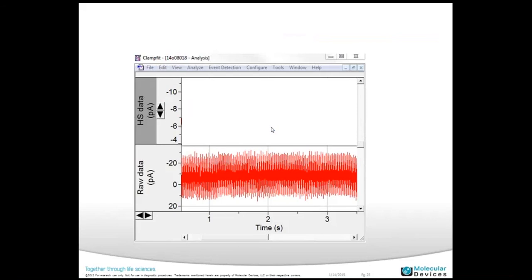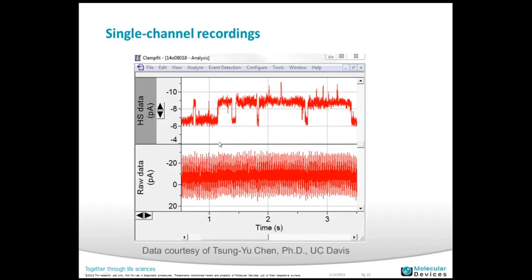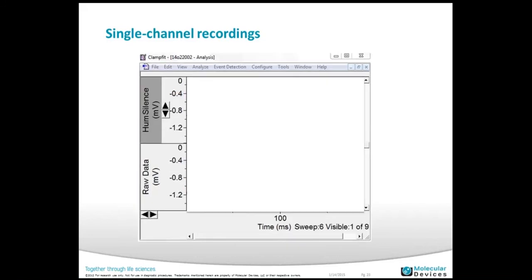In the next slides I'm going to show some amazing data demonstrating how well the Hum Silencer eliminates noise. Do you remember those noisy traces I showed earlier? With the Hum Silencer, you can actually see what's hidden inside that noise. Here is beautiful single-channel data — you can't imagine getting single-channel data from that noisy signal, but with the Hum Silencer you are able to do that. This data was recorded in Dr. Chan's lab at UC Davis during our beta testing.